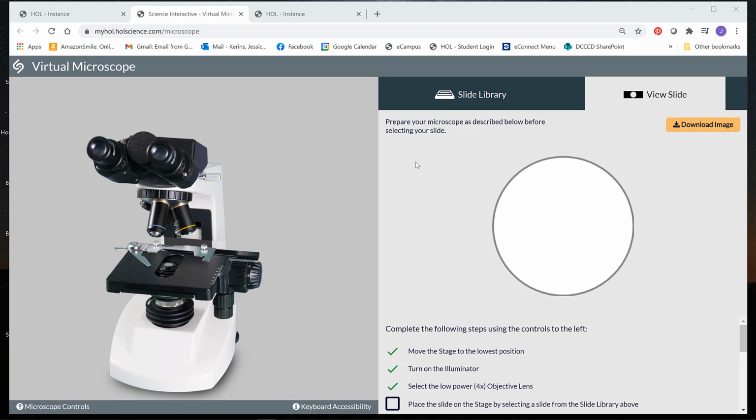However, by the time you reach that magnification, that lens is so close to the slide that you can't use the ruler anymore, because the hash marks on a typical metric ruler, which are a millimeter apart, are too far apart at that magnification. So the field of view at the high power lens is usually less than a millimeter. That's giving you some idea of how big the things are that you're actually looking at under the microscope.